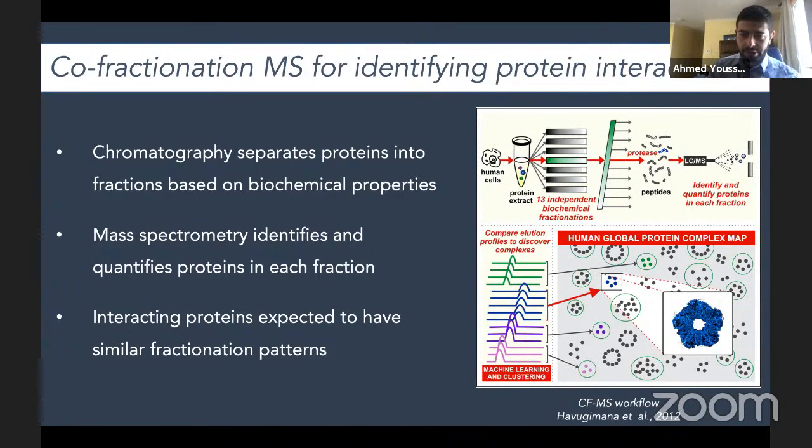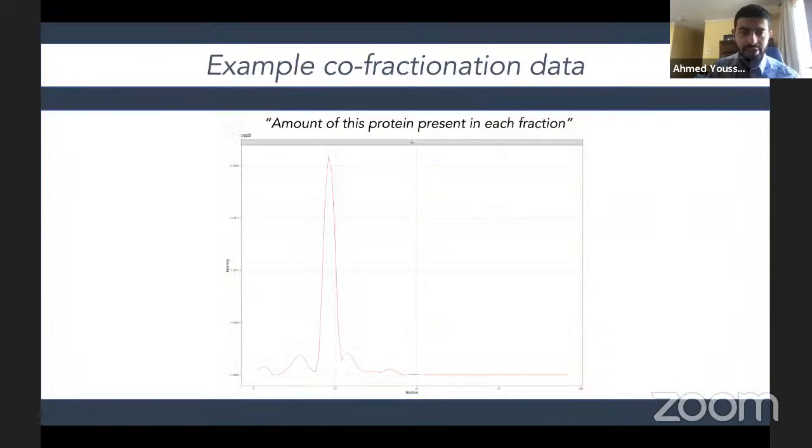Okay, so this is the experimental workflow, but what does the data look like for me on the computational side of things? Here's an example of a protein profile that comes from this experiment, from a data set that was generated in our lab that I'll talk a bit more about later. In this example, on the x-axis we have those multiple fractions I mentioned earlier. Again, this is an earlier fractionation step, even before LC-MS, and this is the intact protein samples before trypsin digestion and all of the standard sample prep. Meanwhile, on the y-axis we have the intensity as a measure of abundance.